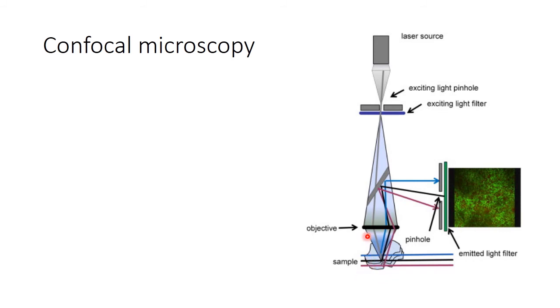When light moves through the specimen, those different planes contribute different rays of light, and all of those light rays coming from different planes are collected by the objective lens. All of those rays contribute to the image of that object.